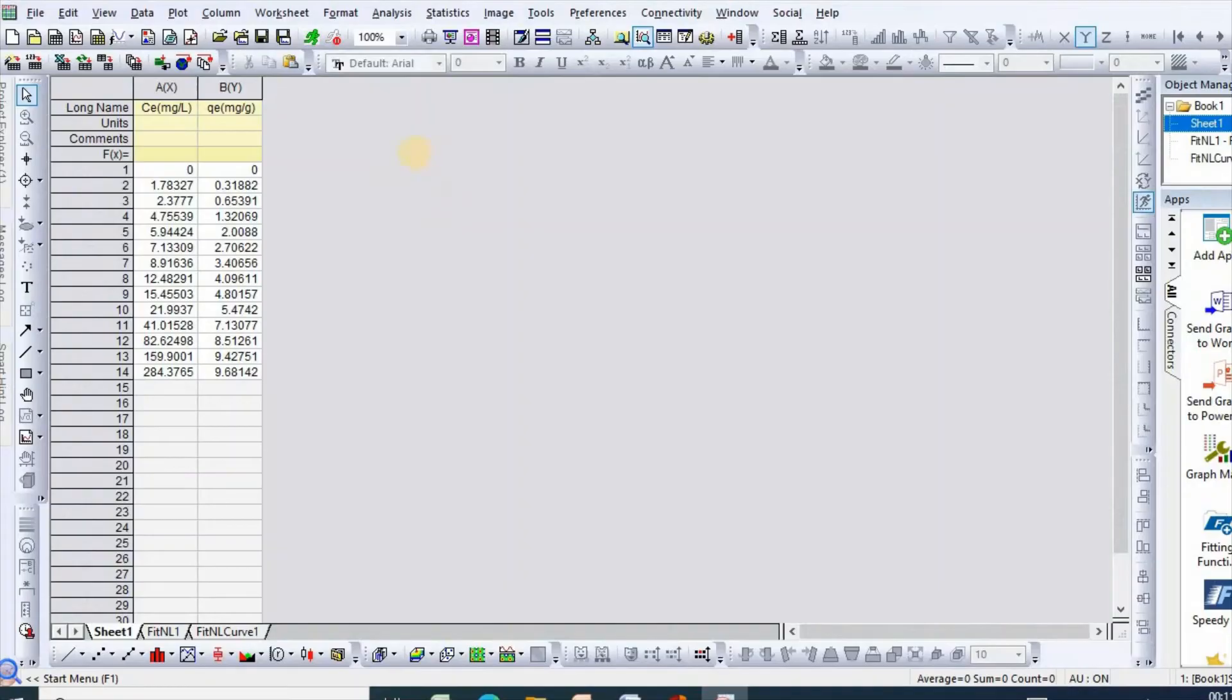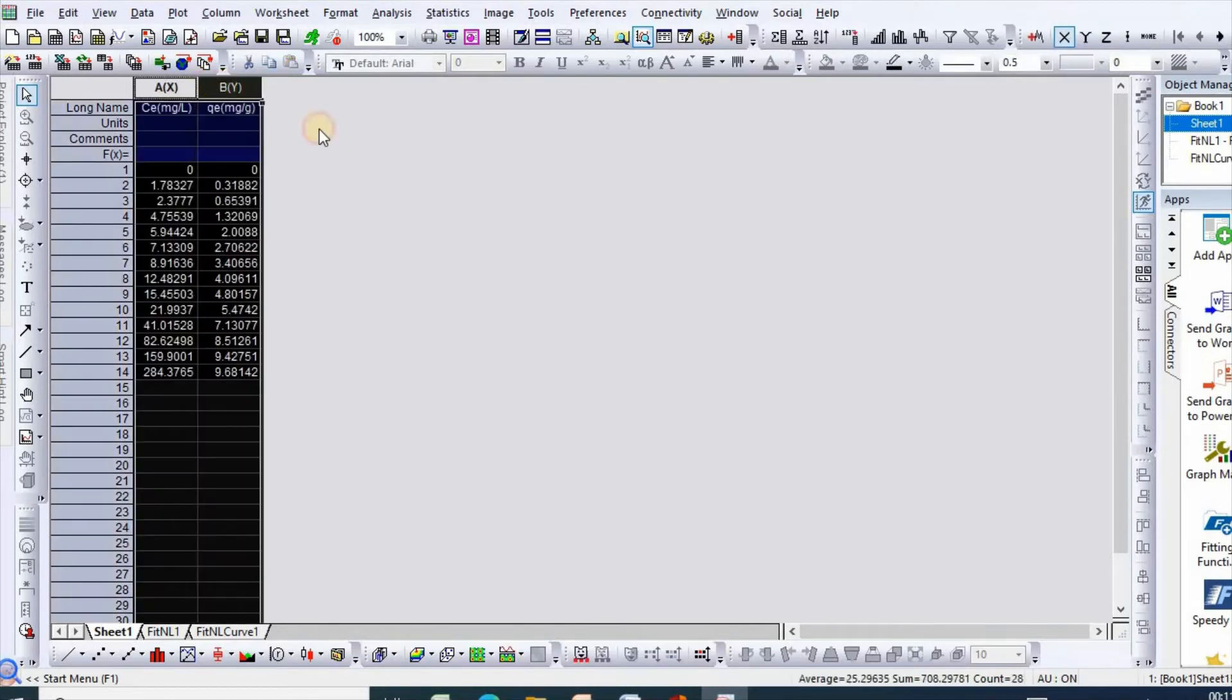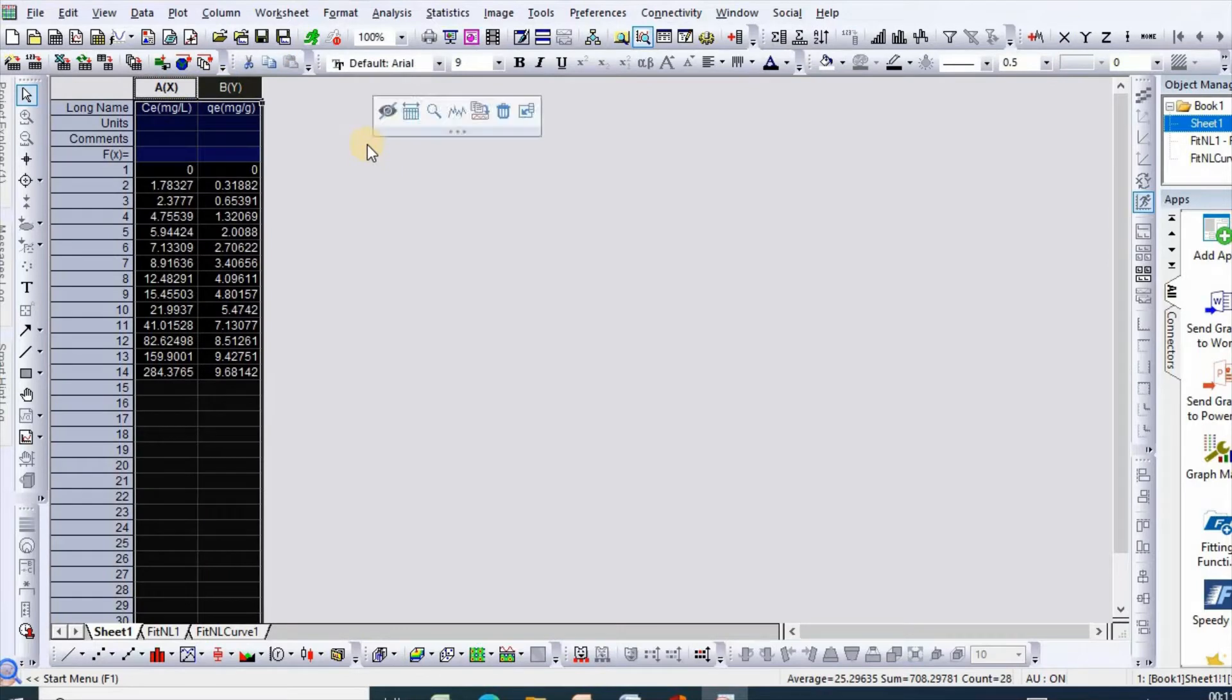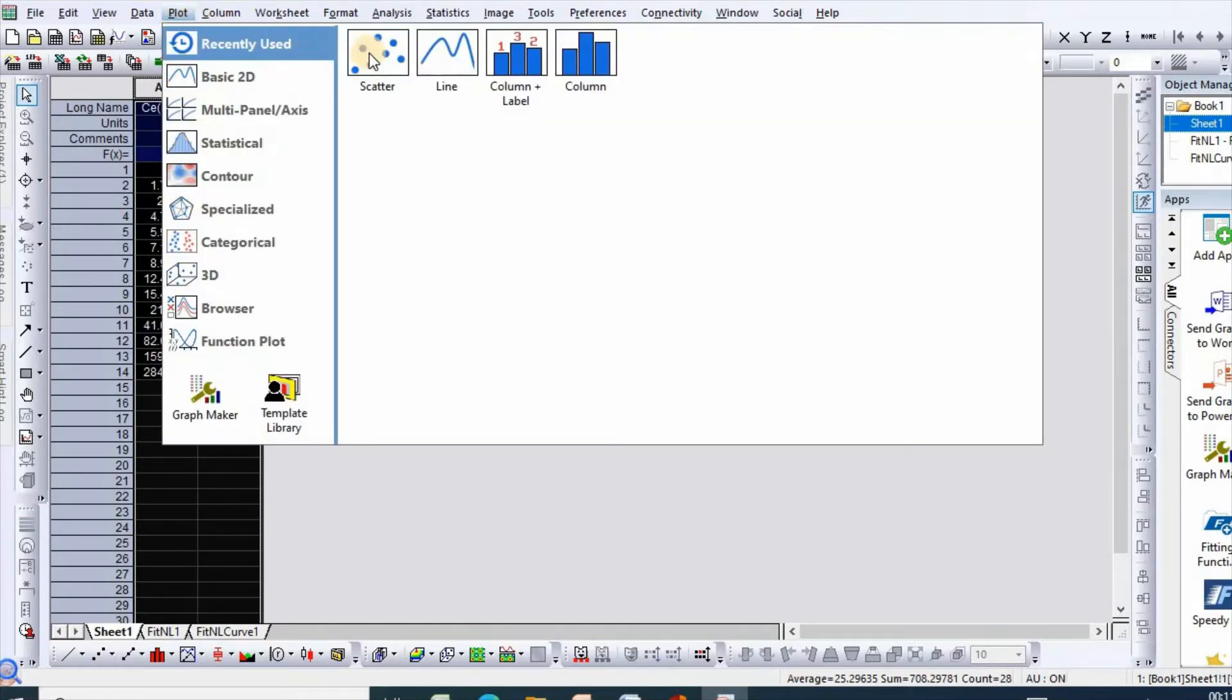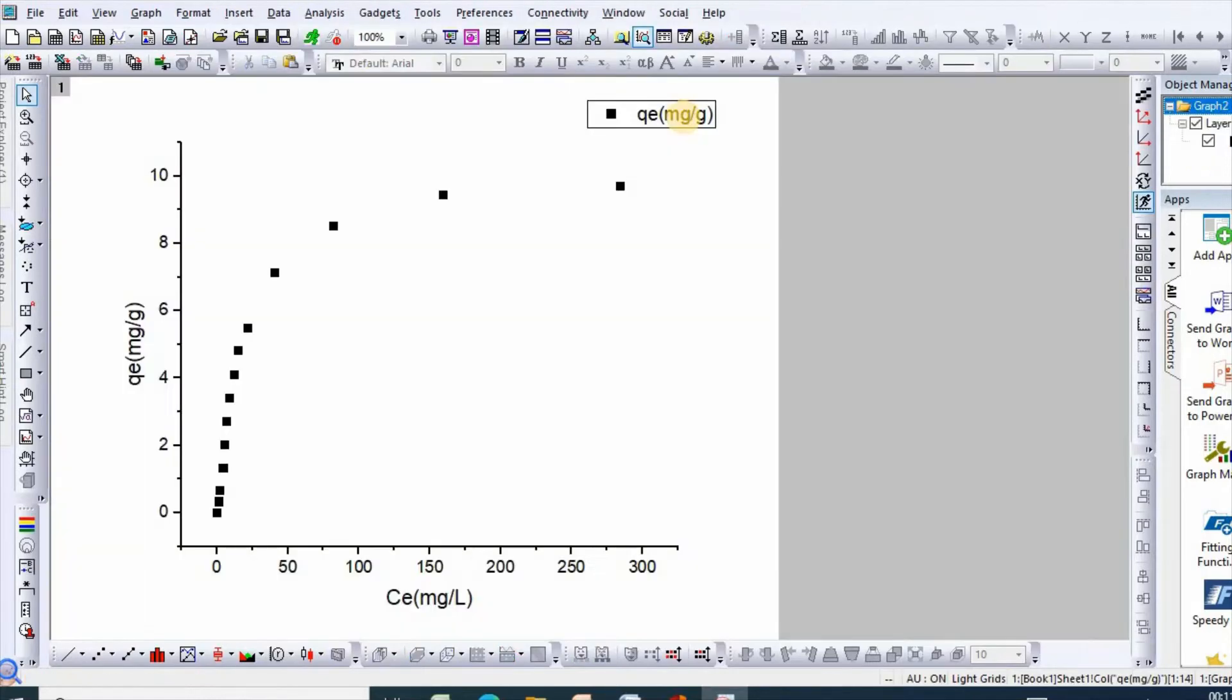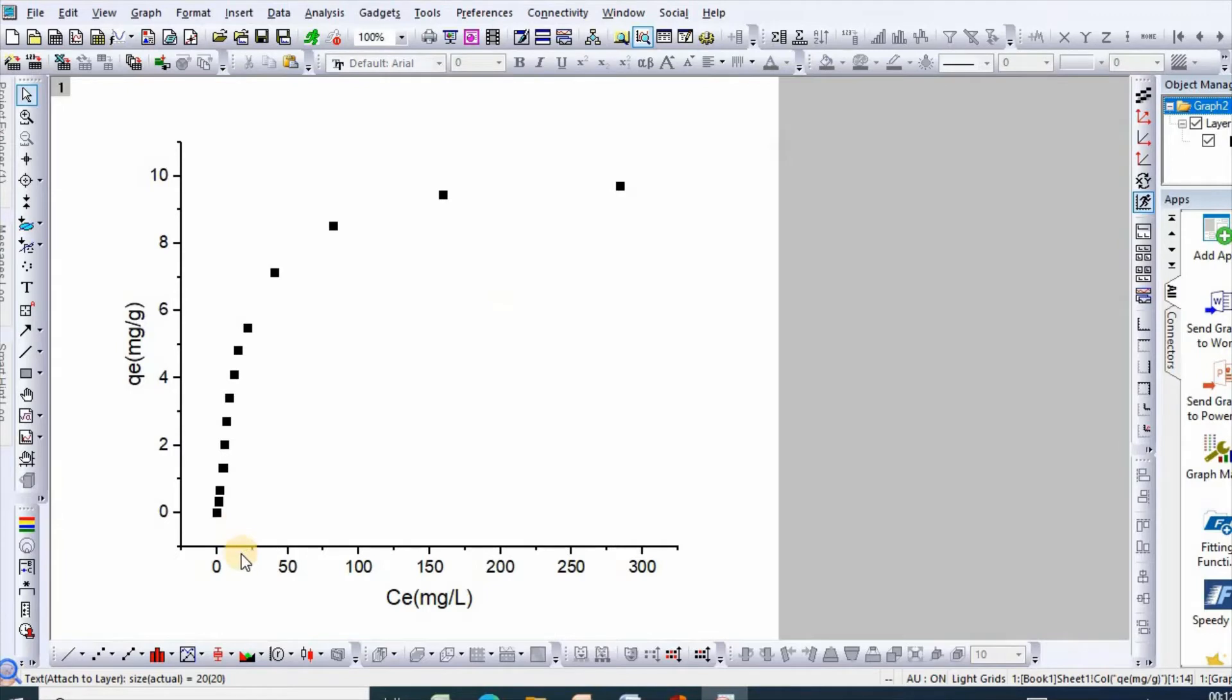In order to do error analysis for isotherm study, I have taken adsorption isotherm data. This video is very important, so please do not skip it. Select and plot, select scatter, and here is your isotherm.